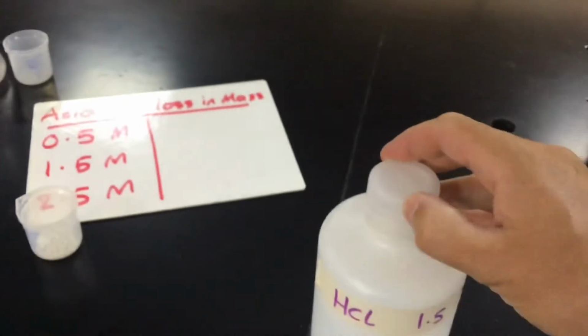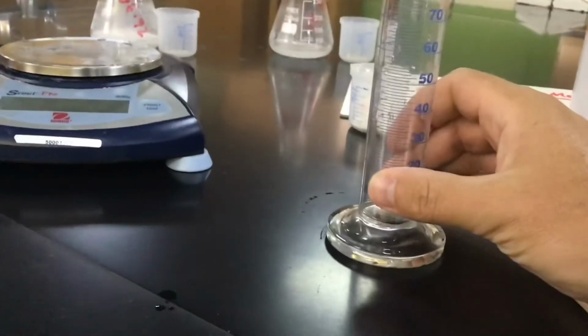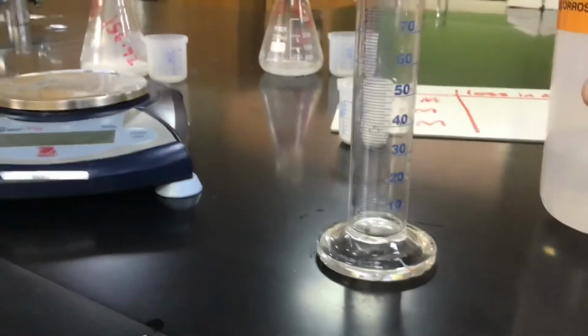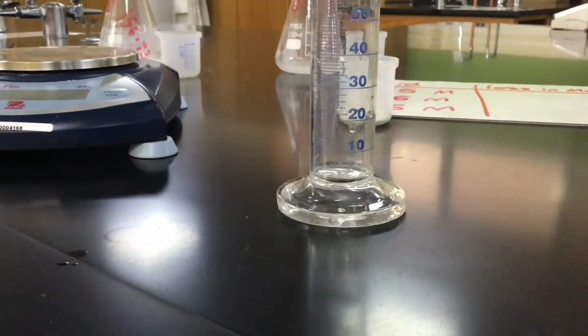The last one will be 2.5 molar. So we need 30 ml of that. A little bit more care over this one because this 2.5 molar is a good strength, very worthy of care and attention.